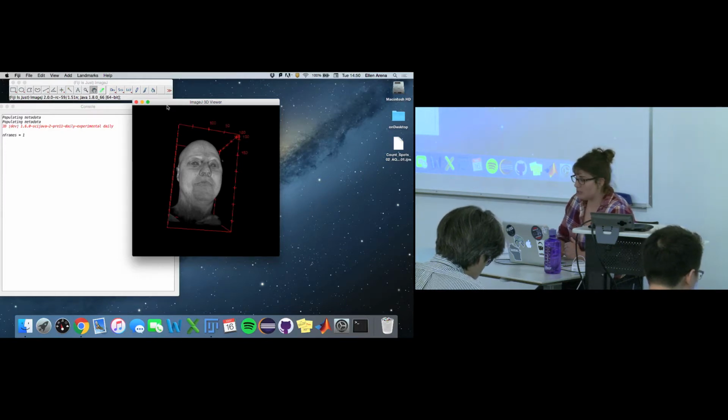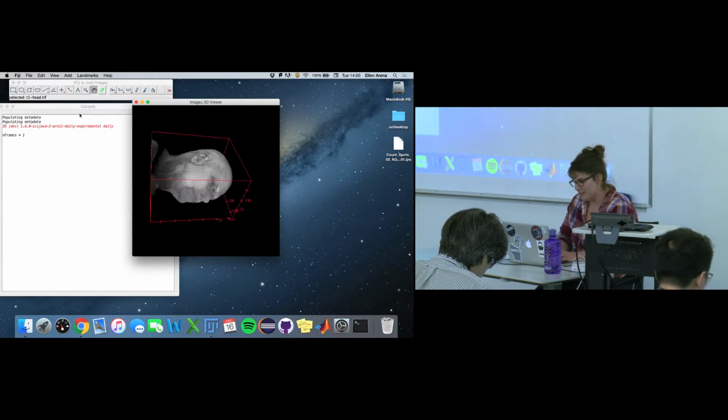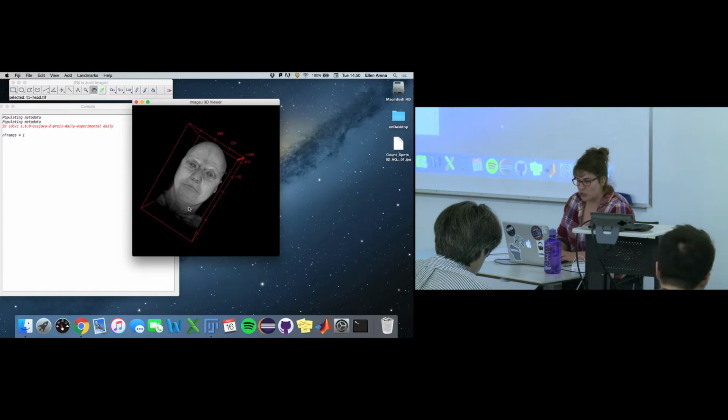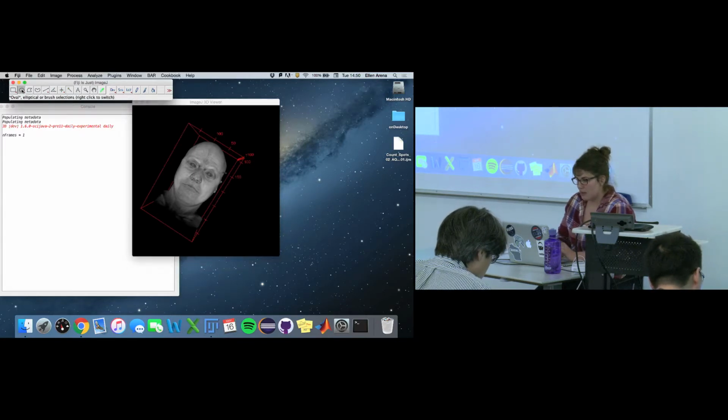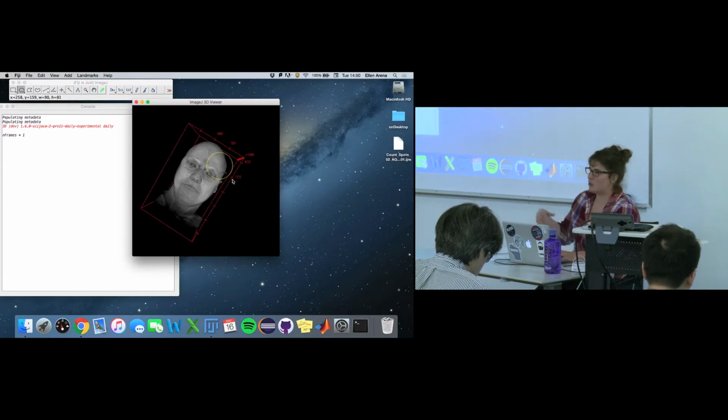For example, you can actually manipulate the data as well inside this guy. So let's just do something kind of fun and a little bit morbid. So let's look at the guy, get him looking at you, and then take this oval ROI. What we're going to do is just draw a circle over his face, but try and get it through the middle. See, I'm not really good. Through the middle of his eye, like his pupil. Something like that. It really doesn't matter. You can draw the circle anywhere you want. And so now there's options here.